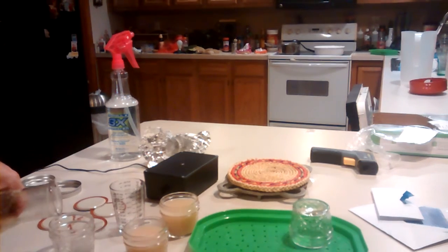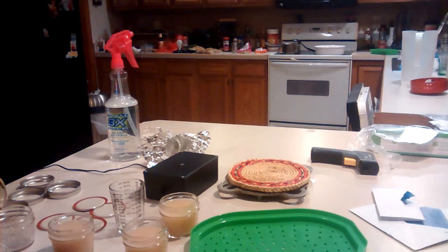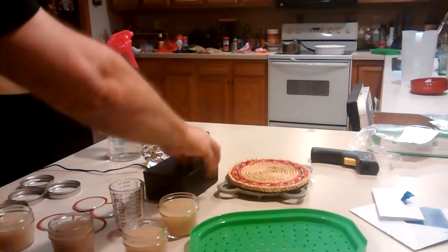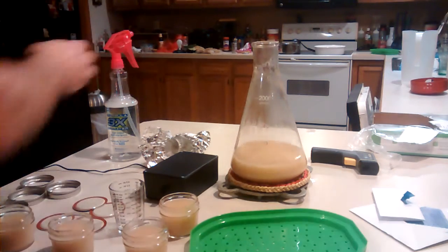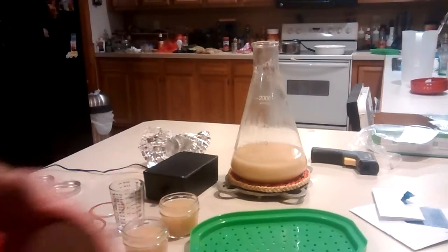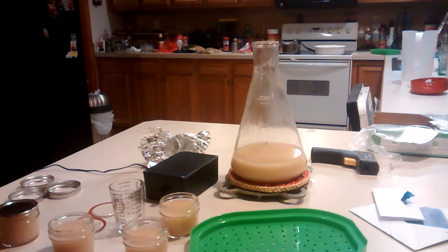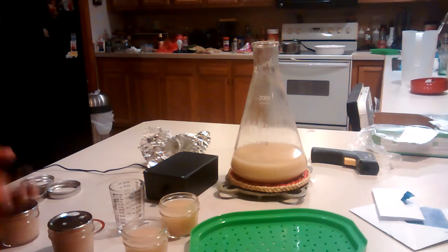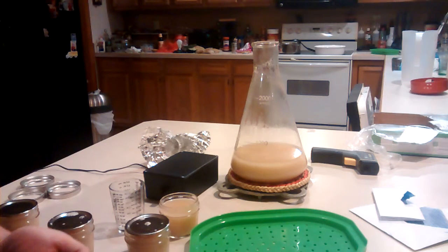2, 3, 4. Just spraying some star sand on the lid, make sure it's sanitary. A little bit of it's going to get in the yeast, but since there's so much yeast in there, I'm not worried about it. 2, 3, 4.